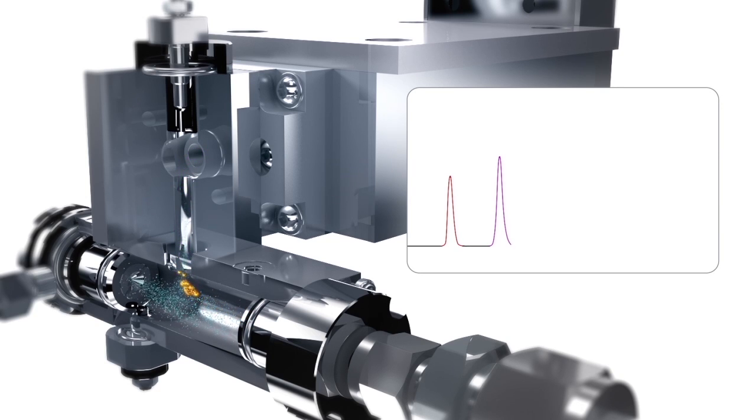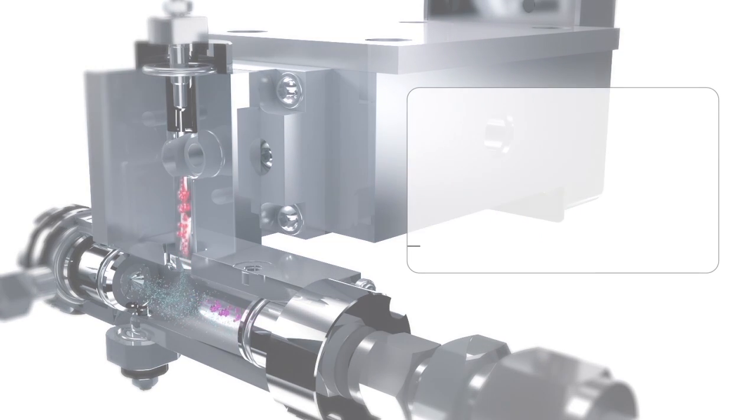This instrument is particularly well-suited for the quantification of substances without chromophores, which are transparent to ultraviolet light-based detectors.